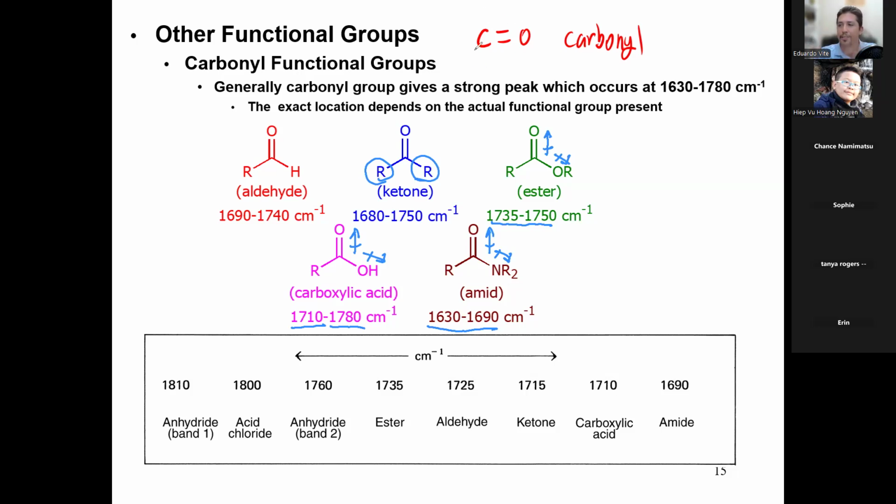It's just again that part. Just like you call this your hand, right? You have the entire me, all of me is Eduardo, but this is the hand of Eduardo. But this is the carbonyl of the ketone, the carbonyl of the aldehyde, the carbonyl of the ester. This is how we talk. This is what it means when somebody talks to you like this, and you have to know what it means.